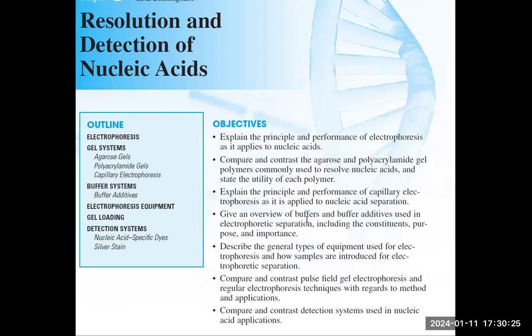So buffers provide protection to the migrating fragments that we have. They protect the samples from sudden or drastic pH changes. The buffers are very good in that, and buffers carry the electric current. It's not the gel that carries the electric current in our electrophoresis setup, but the buffer.